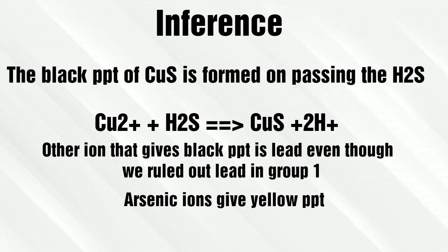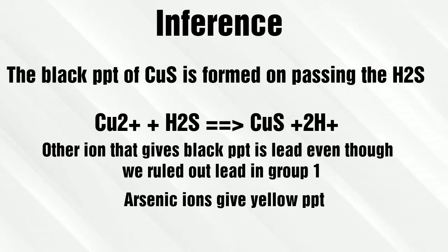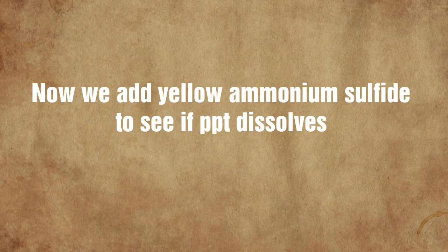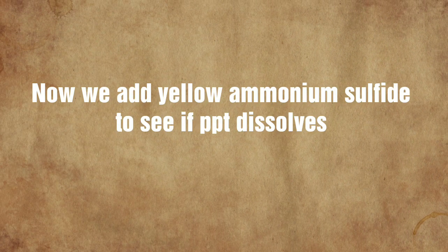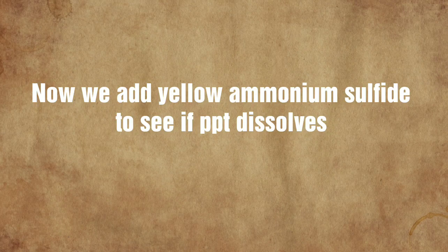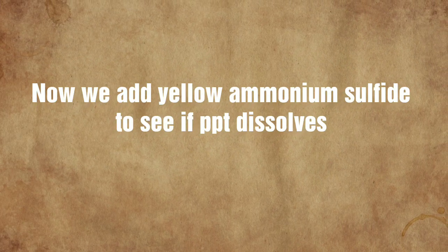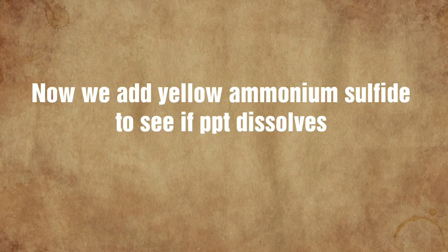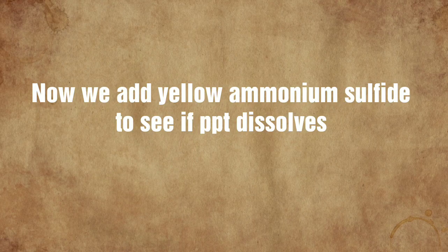The copper ions reacted with hydrogen sulfide forming the black precipitate of copper sulfide. If it was arsenic ions we would have got a yellow precipitate. Now we have two ions in group 2, that is copper and arsenic. To differentiate between these we add ammonium sulfide and check the solubility of the precipitate.